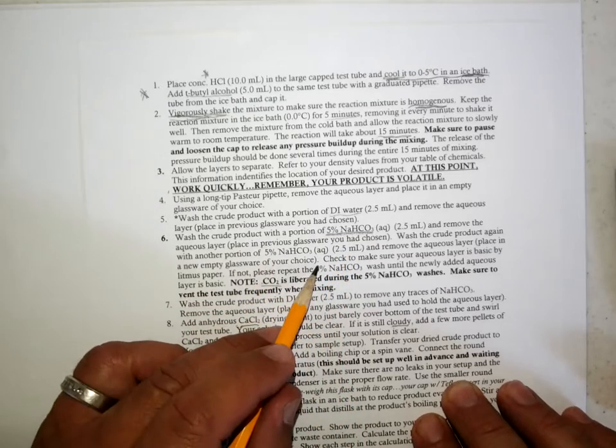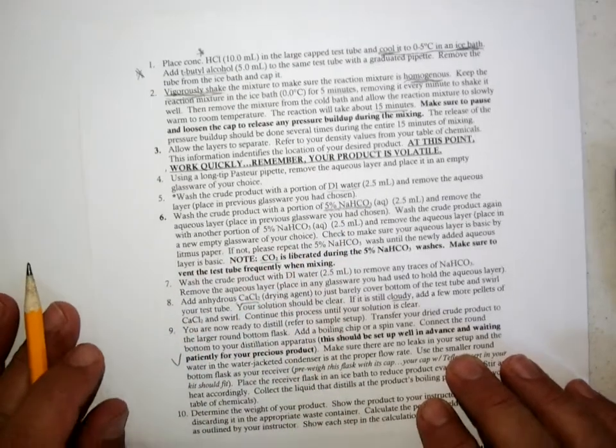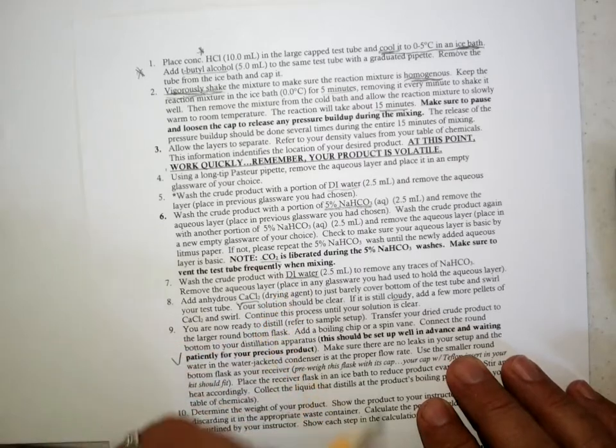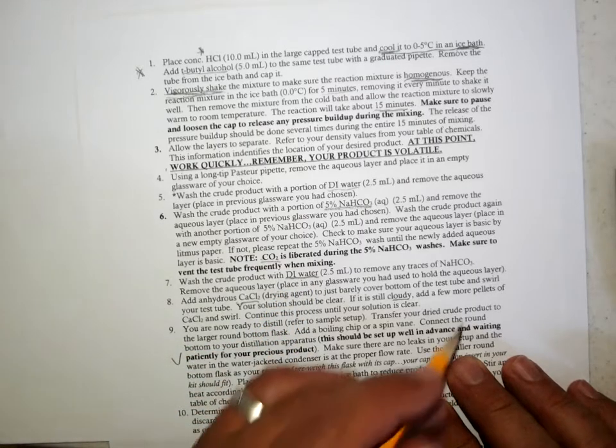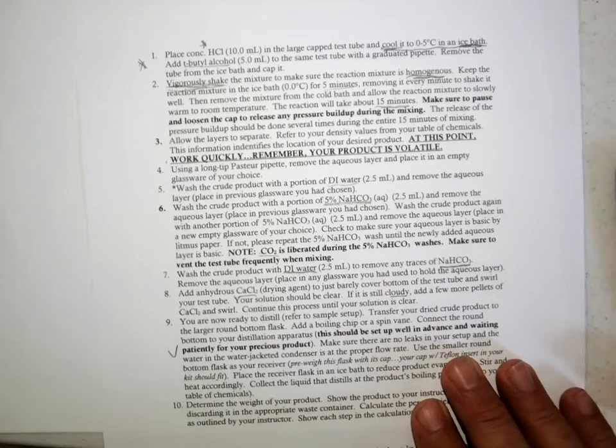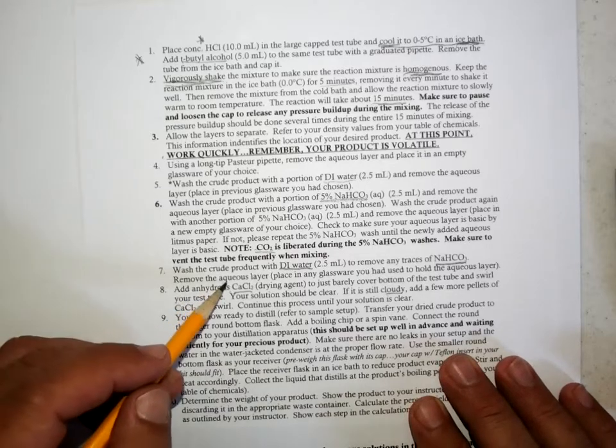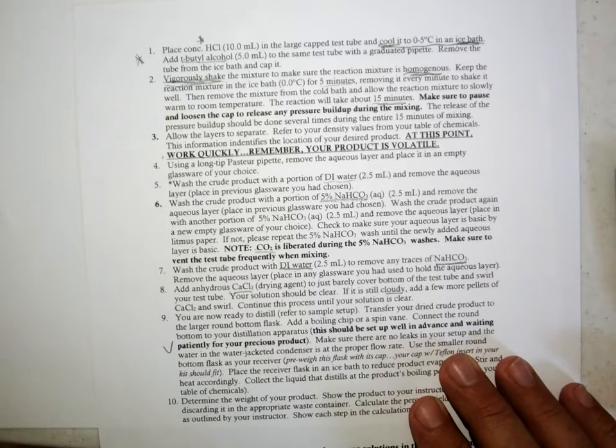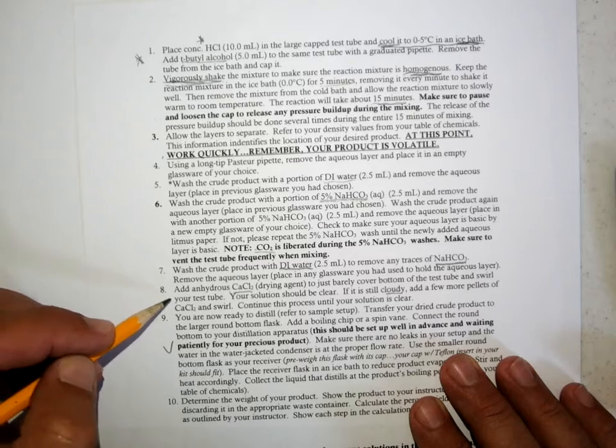Then after you've neutralized the acid, you will generally wash again with DI water to remove any traces of water-soluble impurities such as the excess sodium hydrogen carbonate that might be there. Then you remove the aqueous layer, and that'll be a discard because your product is the organic.